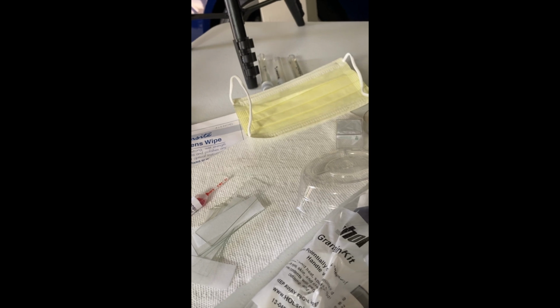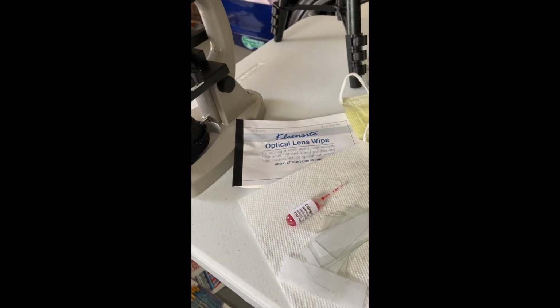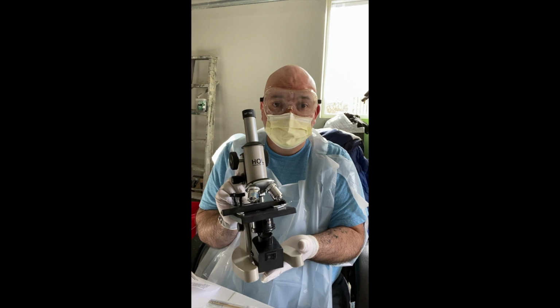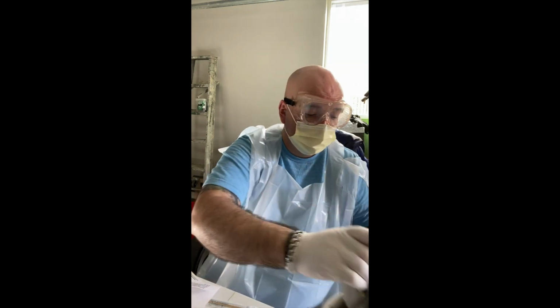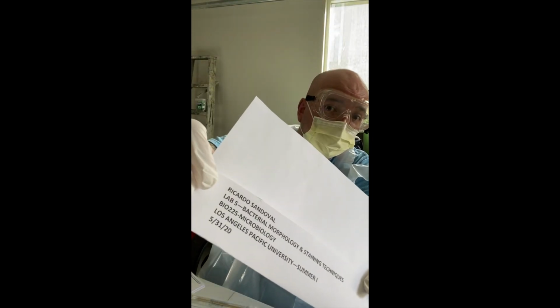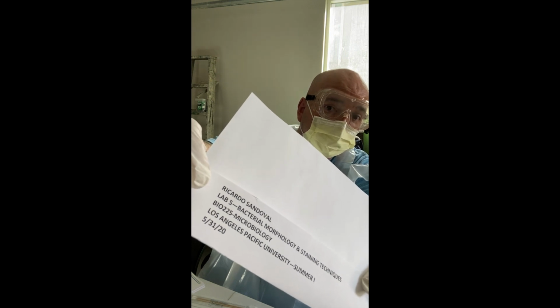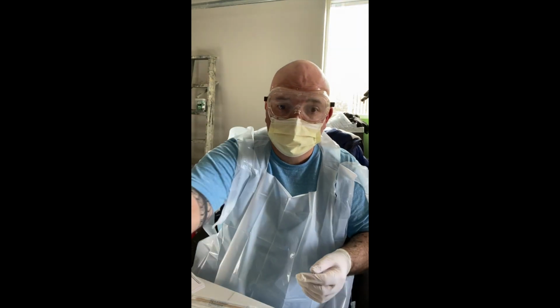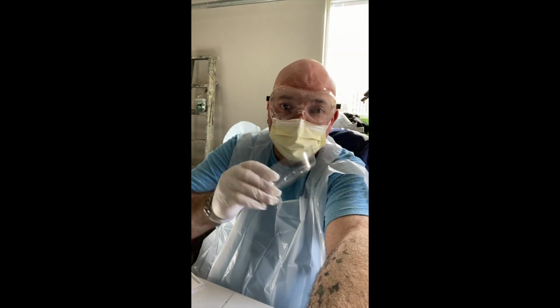Okay, so with that being said, I'm going to put on my gloves, put on my face mask, so I do apologize if I sound muffled, and then we'll go ahead and get started. And then of course I also do have my microscope that I'll be using to view the 2 teeth gum specimens that I take once they're stained. And then of course I also made this, which is just a quick little sign, just summarizing my name, today's date, the lab, class, school term. Alright? And then I will also be using this tray to stain the slides.